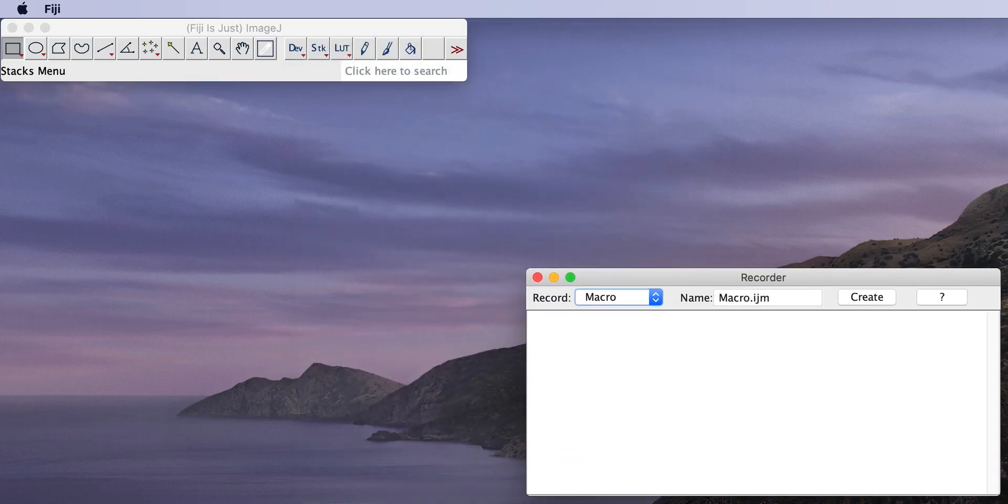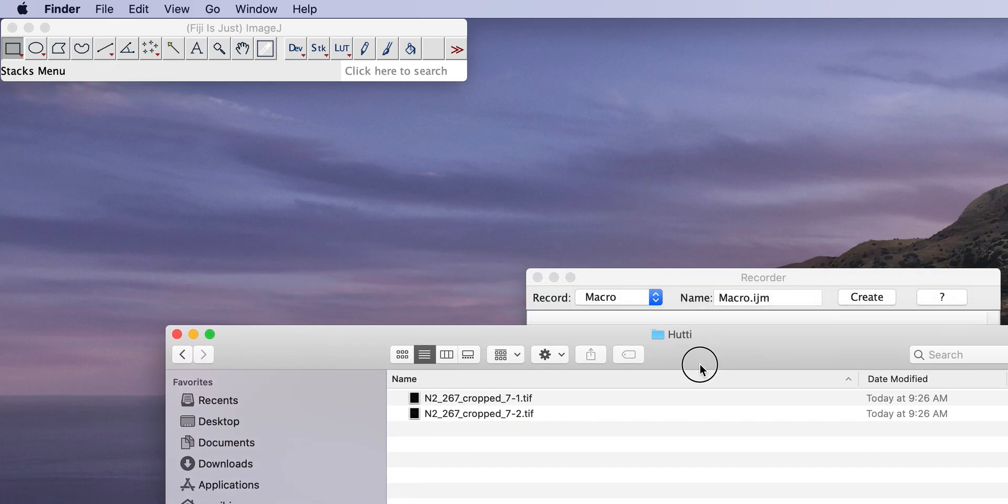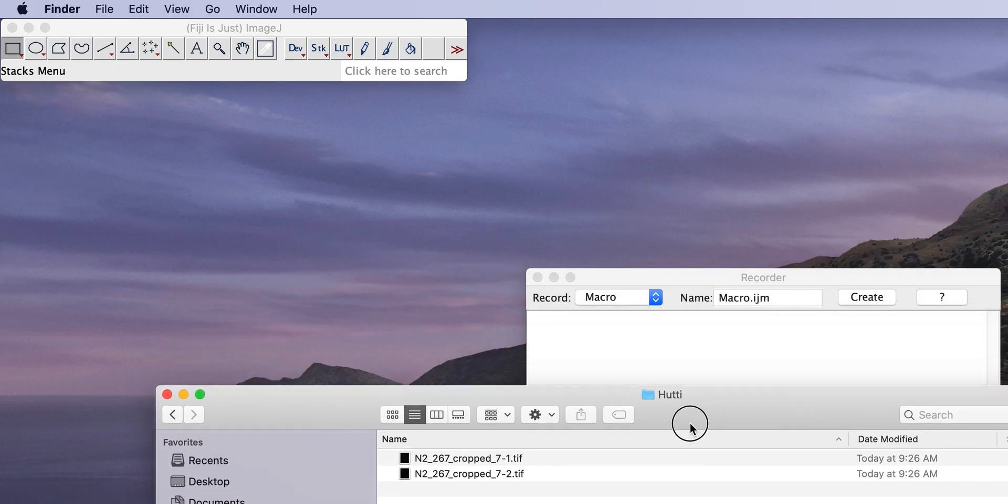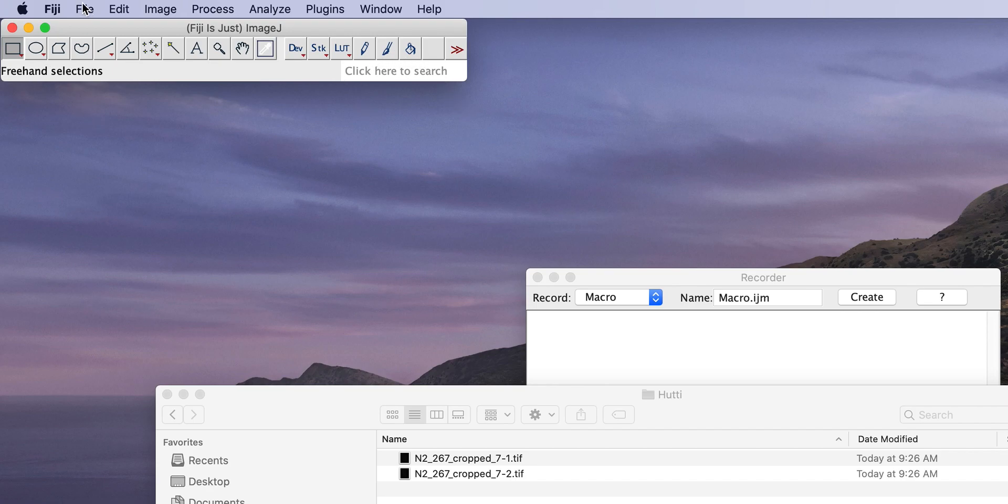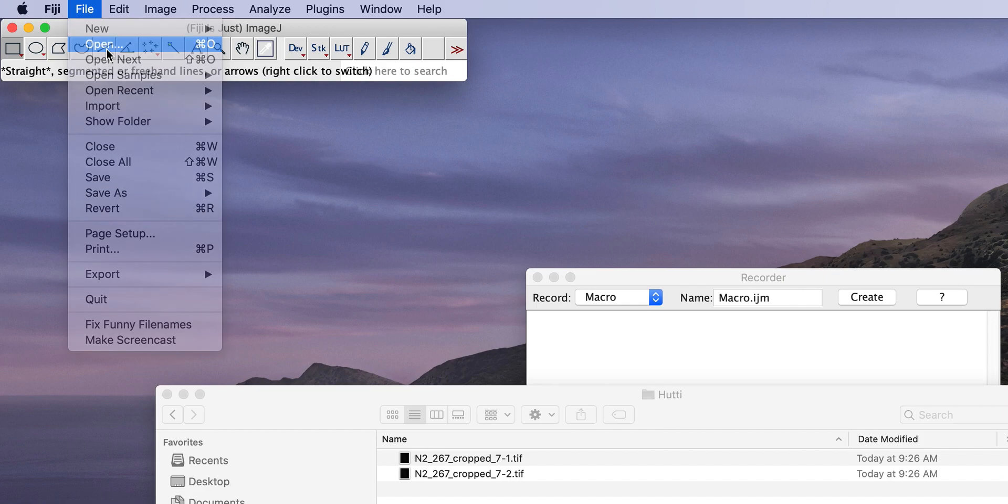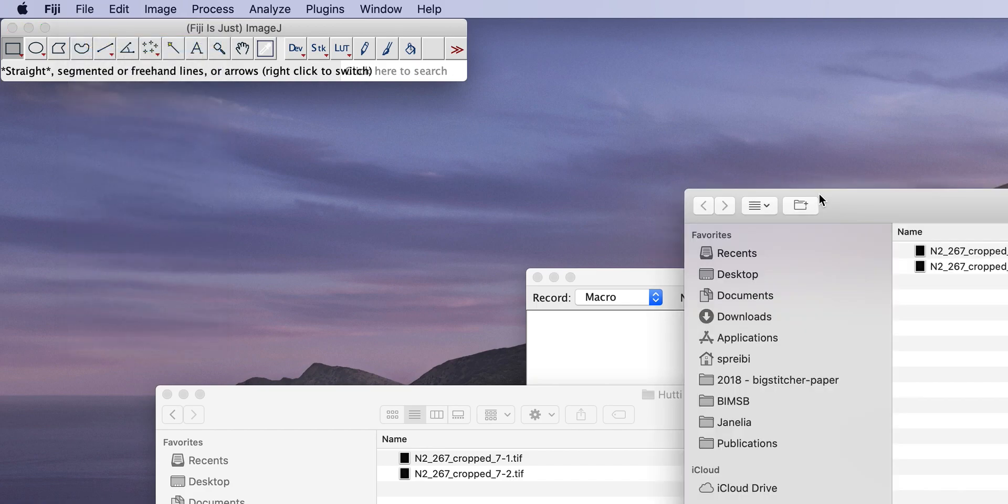So I have a very simple example now. I just have two images that I want to align but the same basically works for time series or more complicated sets but it starts very simple and I think you can pretty straightforward extend it from there. So what we first need to do, and this is now for the macro recording, we do open those two files.